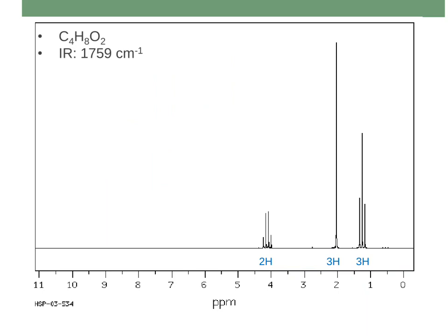How about this one? Here's a new one, new formula, new IR data. Again, you should look at your IR data, and if you don't remember, 1759 is almost certainly a carbonyl. I remember alkenes are a little further down, more like 1600 or 1500 or so. If I look at my formula up here, I see that I have 1 degree of unsaturation, because I'm missing a couple of hydrogens. So I've got either one ring or one double bond. I know it's a double bond because there's a carbonyl here. There's no ring, only 1 degree of unsaturation.